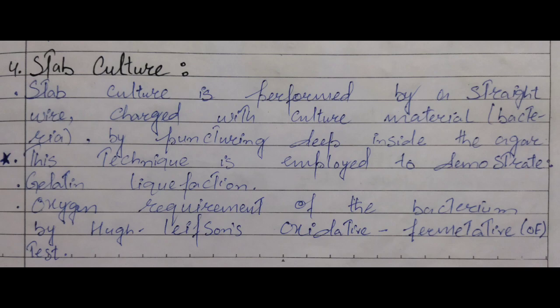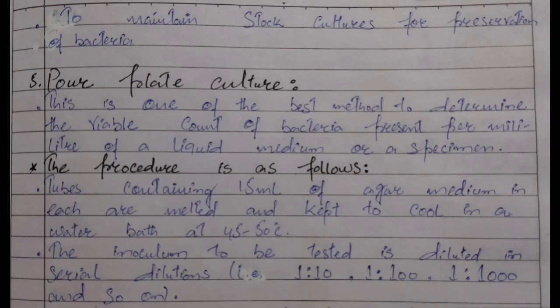Stab culture. Stab culture is performed by a straight wire charged with cultured material, by puncturing deep inside the agar. This technique is employed to demonstrate gelatin liquefaction, oxygen requirement of the bacterium by Hugh Leifson's oxidative fermentative OF test, and to maintain stock culture for preservation of bacteria.